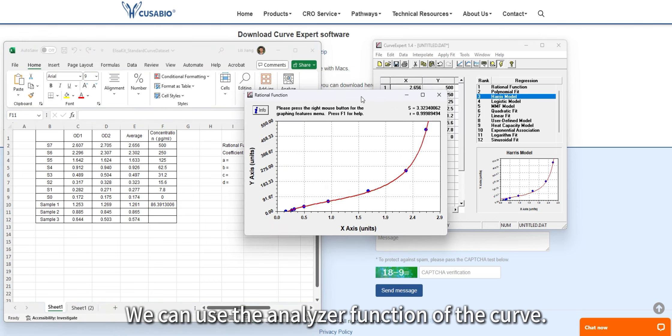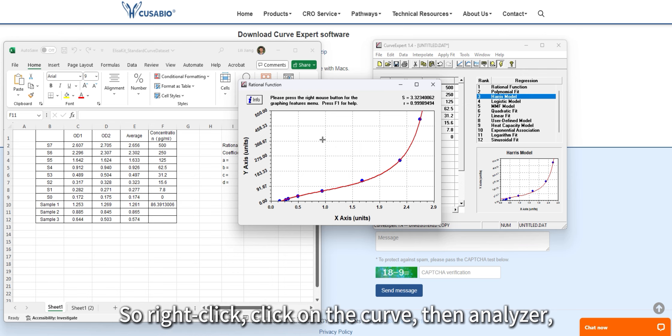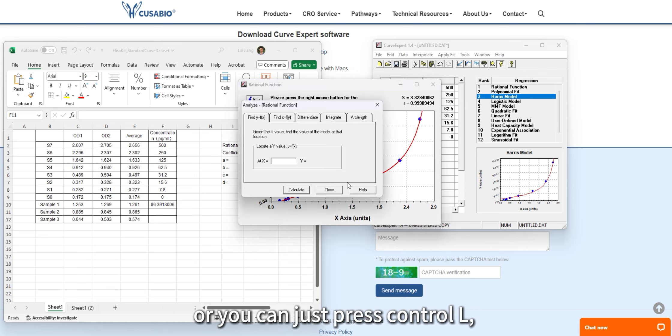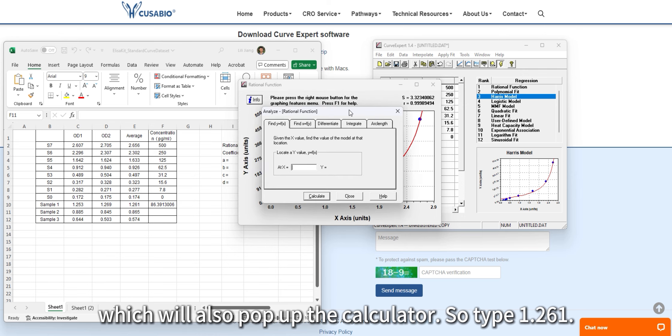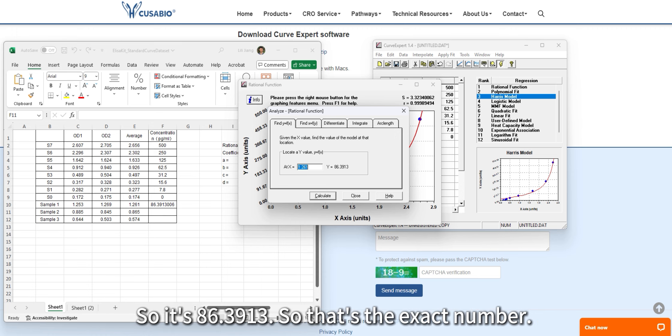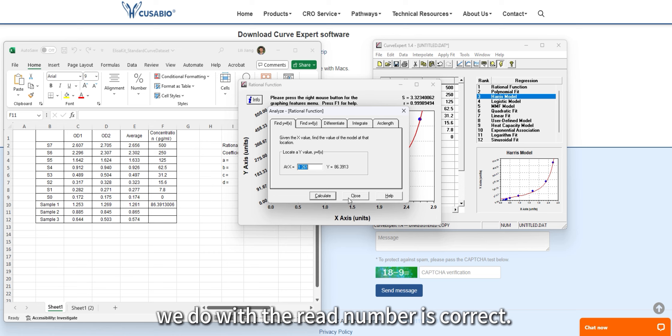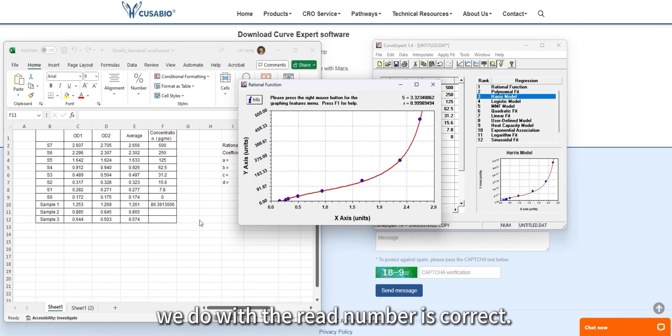We can use the analyzer function of the curve. Right-click the curve and select Analyzer, or press Control+L to open the calculator. Type in 1.261 and you get 86.3913. That's the exact same number, so our function is correct.